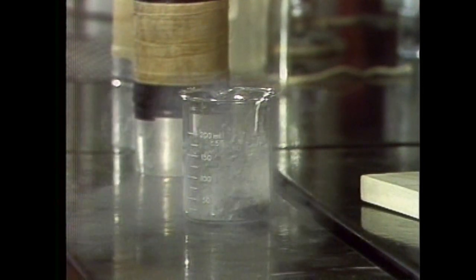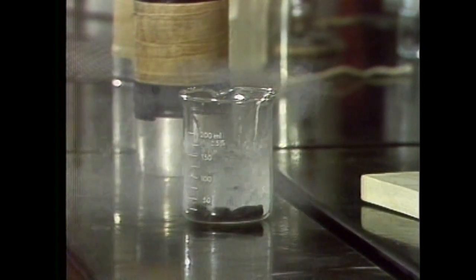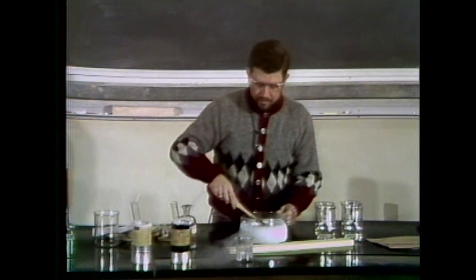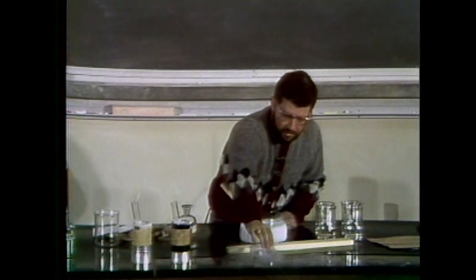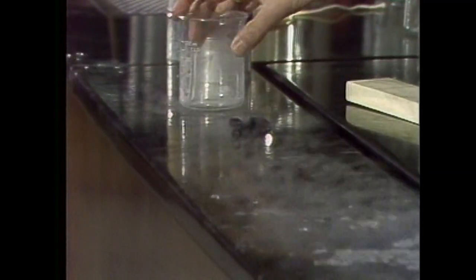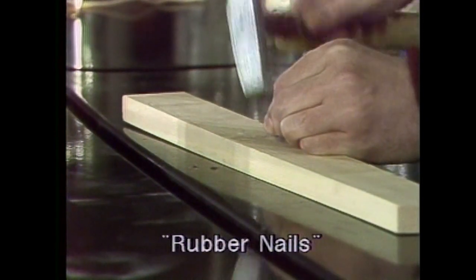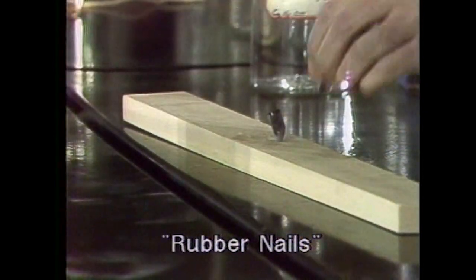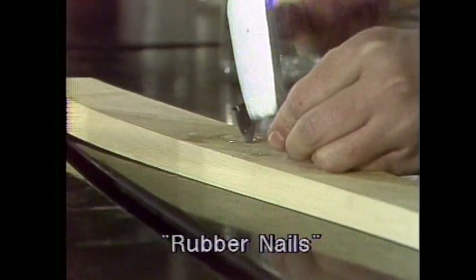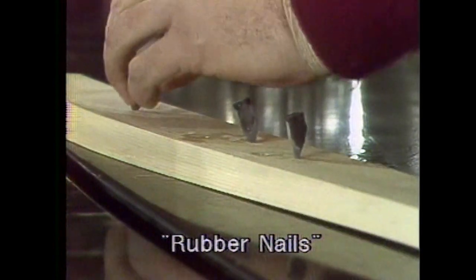Meanwhile, checking on my two goodies here. And you see, this is solid mercury here. And what I'm going to do now is, I think they're frozen. I'm going to take these spikes, you see, and use a mercury hammer to drive them in. Stuff is cold. One more.